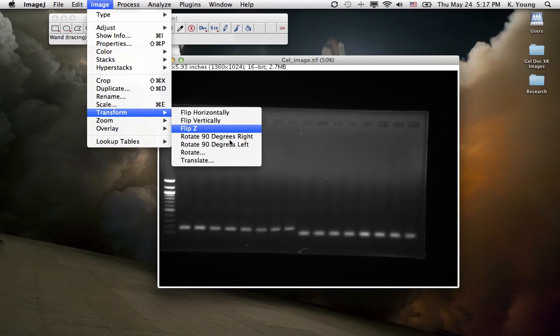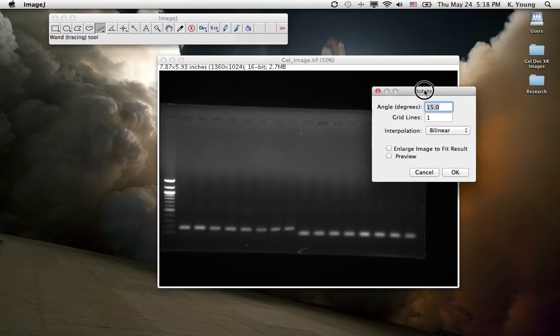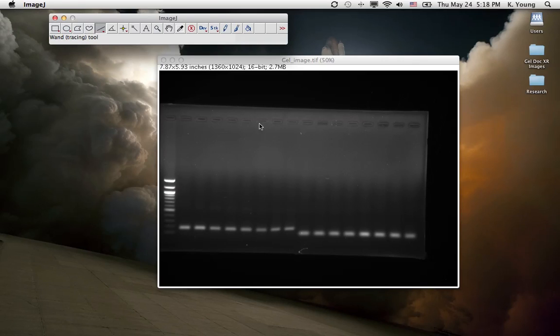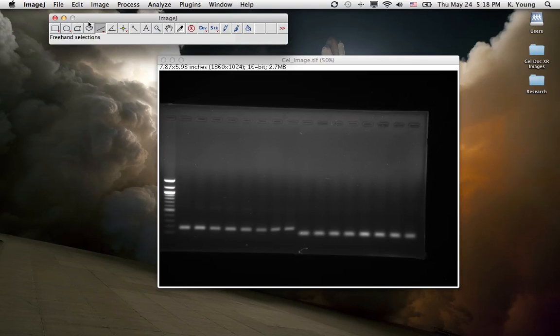Transform, Rotate. You can rotate this arbitrarily however you want. Basically what you want is the bands to be about 180 degrees lengthwise. But we're not going to do that.